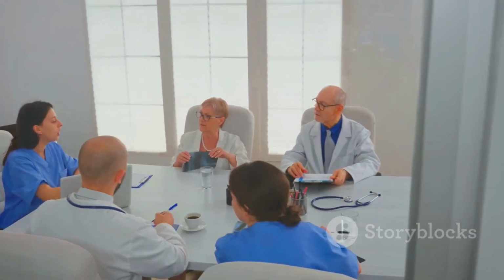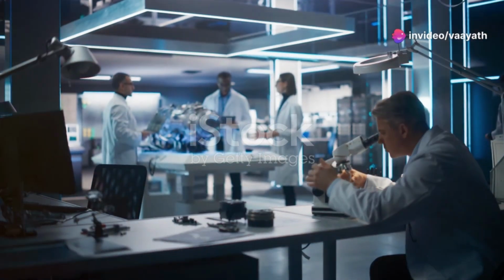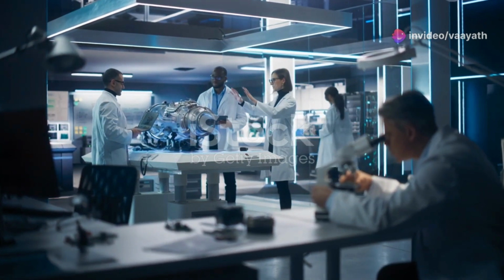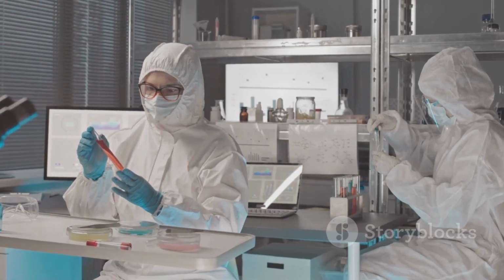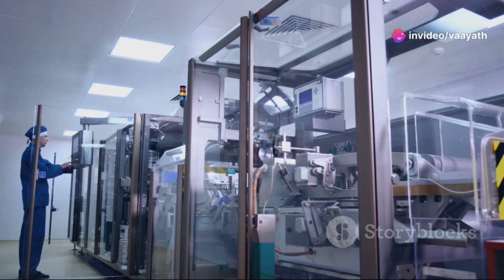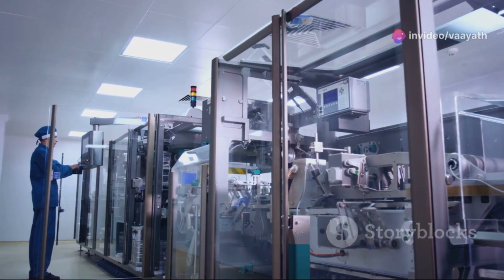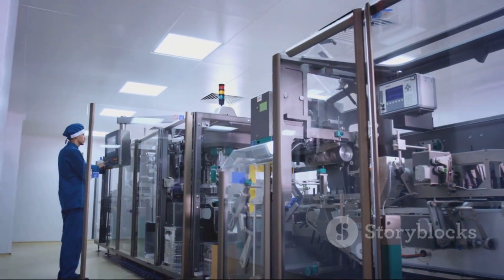Section 9. Importance of collaboration in media fill validation. Media fill validation is not a solo act. It requires seamless collaboration between different departments within a pharmaceutical company. The microbiology department plays a central role, designing the study, analyzing the results, and providing expert interpretation. The manufacturing department is responsible for executing the media fill process, ensuring it accurately reflects the actual drug manufacturing process.